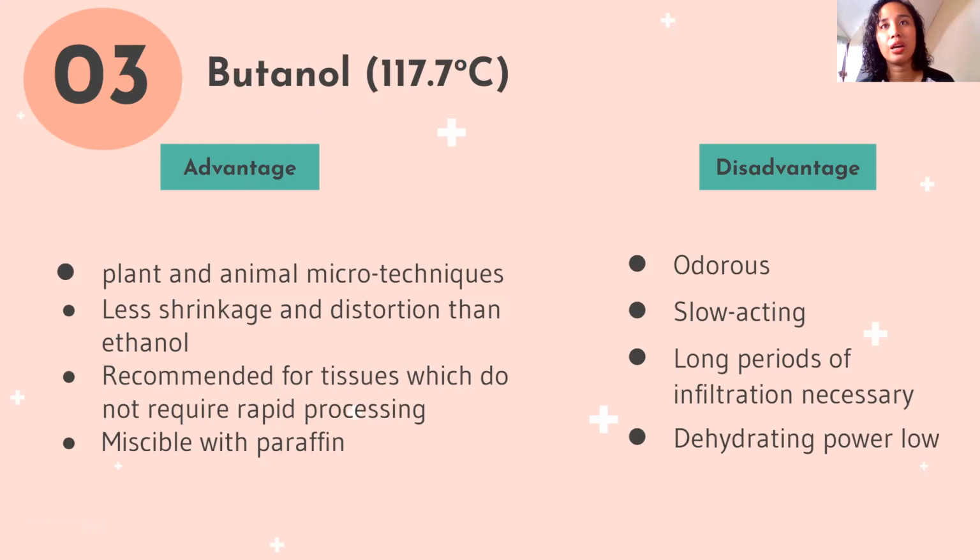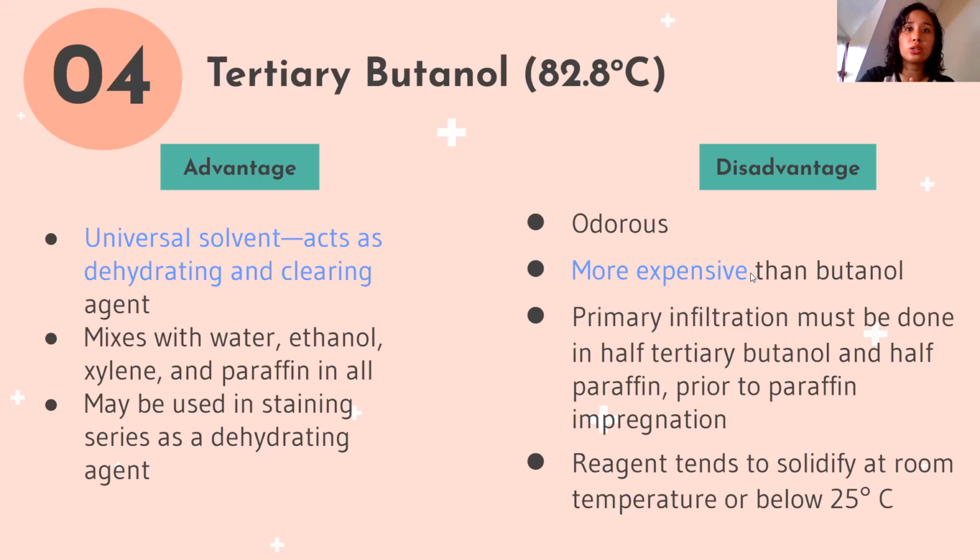So if yung mga biologists, mas recommended sa kanila itong butanol because di sila nag-aalala masyado sa time sa mga research ng plants and animals. Unlike pag sa hospital, diba? It's miscible with paraffin. Guys, when it's odorous, you should use a fume hood. Odorous rin to, tertiary butanol. However, it's good as a dehydrating agent and clearing agent.